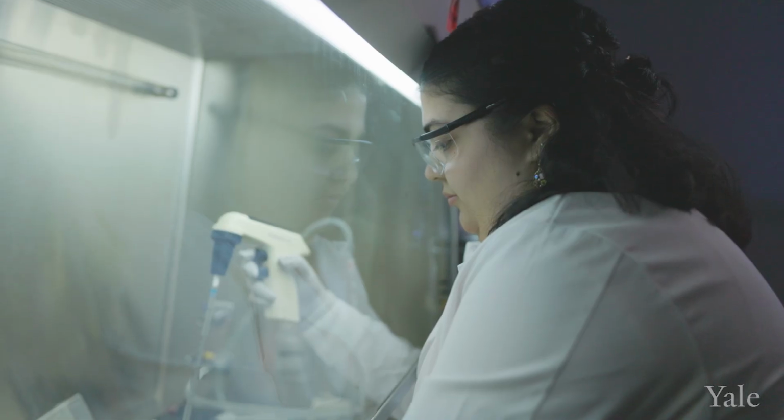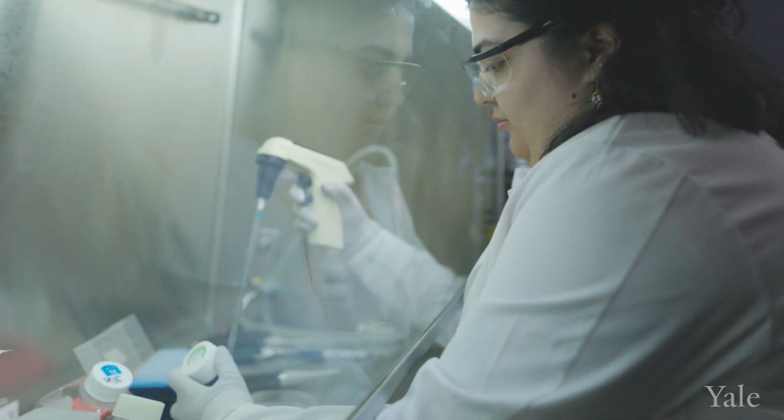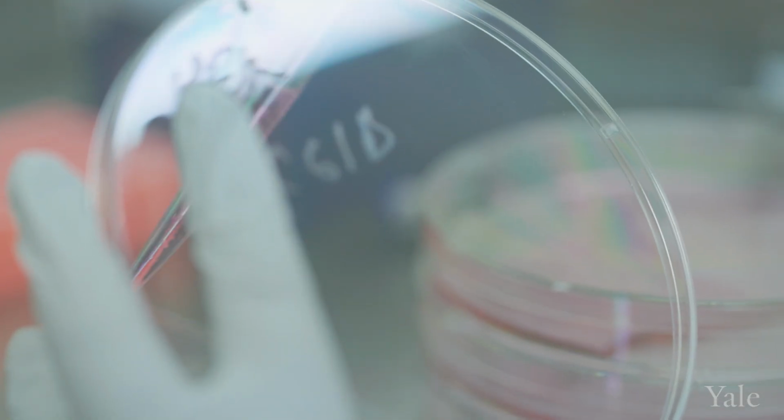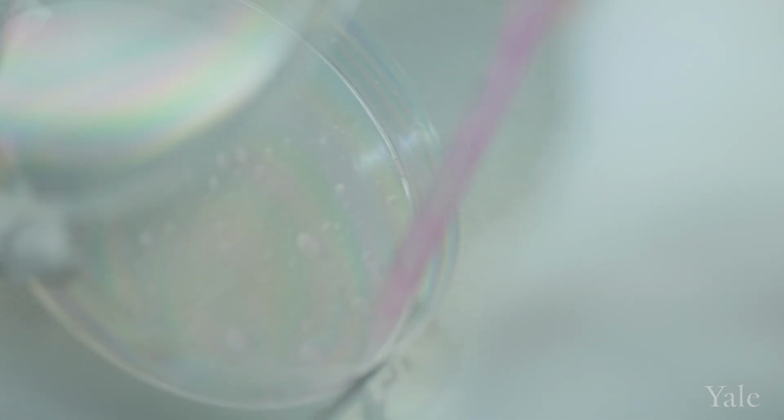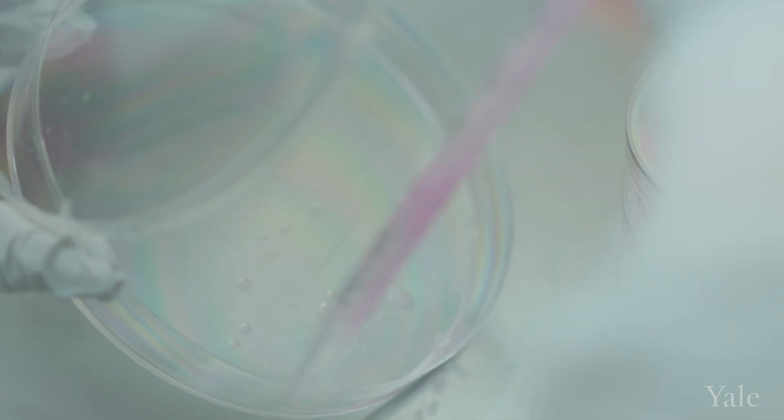My lab's research is to really understand membrane proteins. To understand that, you need a variety of techniques and tools in a multidisciplinary approach. So for example, if you want to understand a protein X and where they meet their molecular friends and neighbors, you need to have a nanoscopic view where you can home into that region of a membrane where those interactions are taking place. So that's where some of our synthetic chemistry tools and chemical biology tools come in, where we develop approaches that allow us to effectively cookie cut the membrane into small segments where we can really target into a particular region of the membrane where a target protein, where specific interactions are taking place.